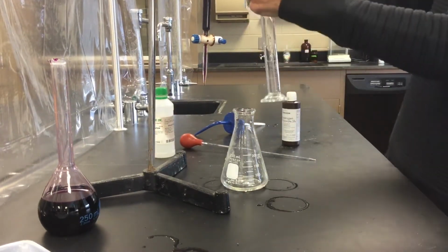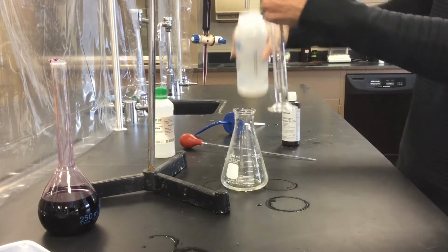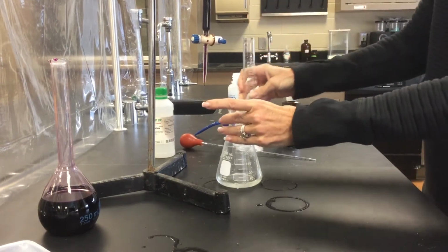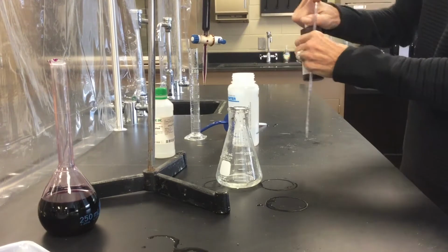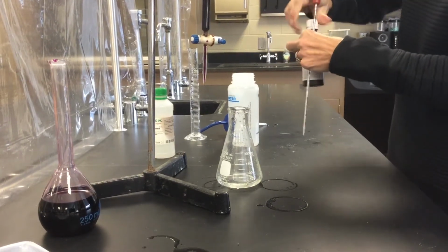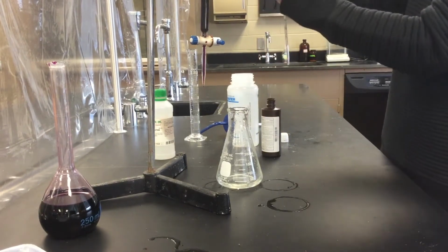There's our 10 milliliters sulfuric acid. Same thing, 10 milliliters of water, although water doesn't really matter too much. And now here comes the fun part. Get to use a baby pipette to add, just adding 1 milliliter of the hydrogen peroxide.